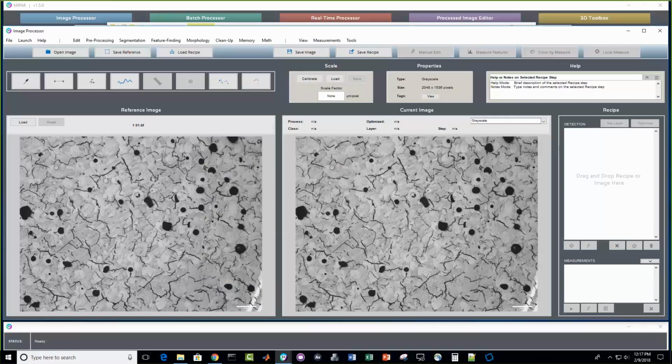So yes, what is the maximum image size? Is MIPAR limited by the computer resources or by MIPAR itself? Great question. That would be the computer resources. So the workstation I'm working on today has about 8 gigs of RAM, a quad-core processor, and a Quadro 600 GPU. And it is very capable of handling images with snappy response, I would say, up to 4K.